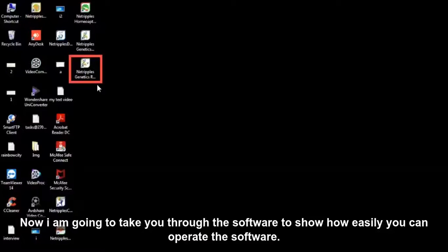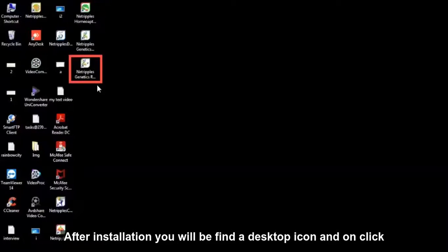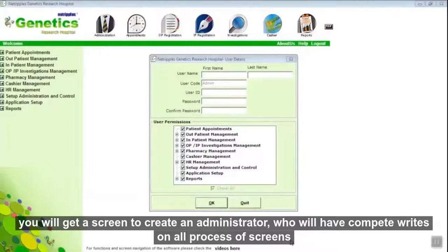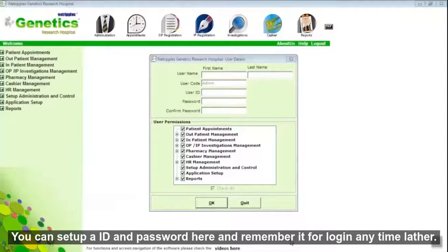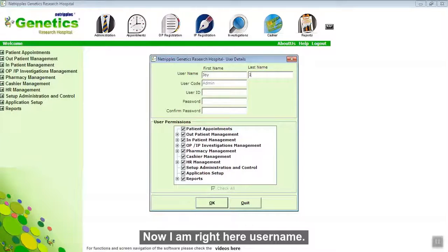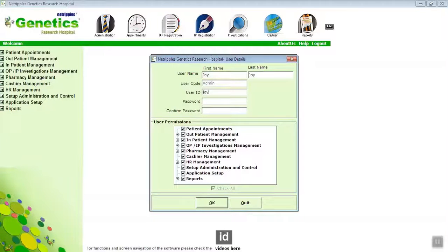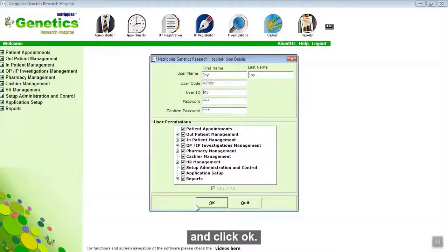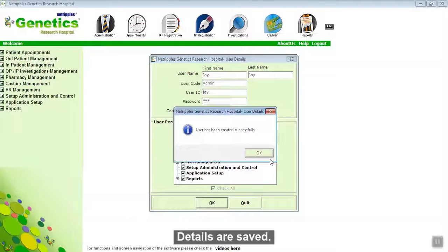Now I am going to take you through the software to show how easily you can operate it. After installation, you will find a desktop icon. On clicking it, you will get a screen to create an administrator who will have complete rights over all processes and screens. You can set up an ID and password here and remember it for login later. Enter the username, ID, and password, give the permissions for that user, and click OK. Details are saved.